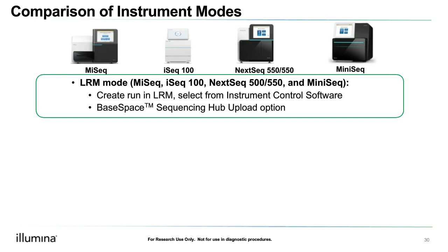And also you have the option to upload the run to BaseSpace. That will be the BaseSpace upload option, meaning you can select the run to upload to BaseSpace for run monitoring only, or run monitoring and storage.